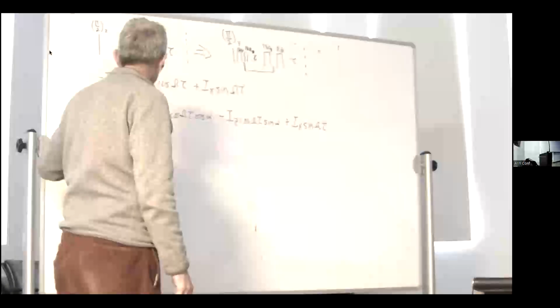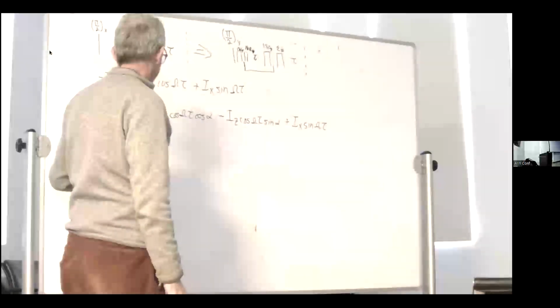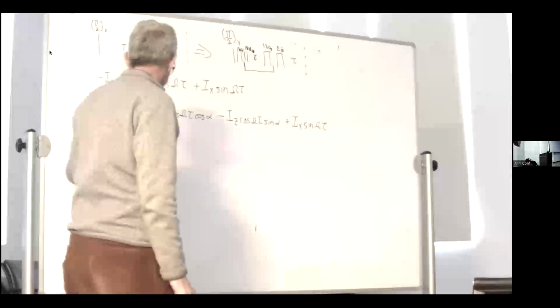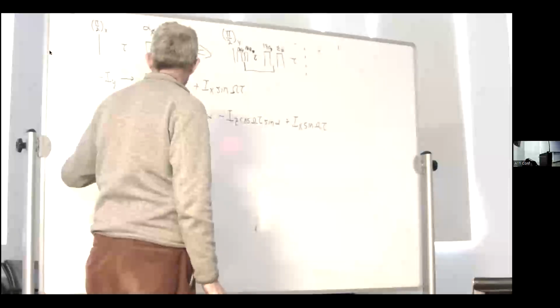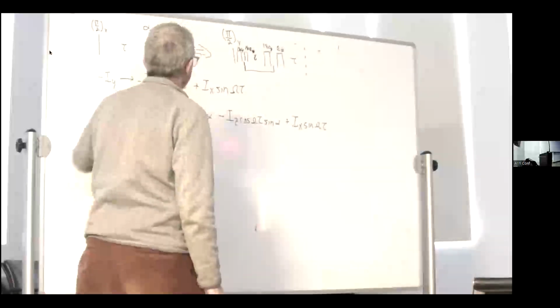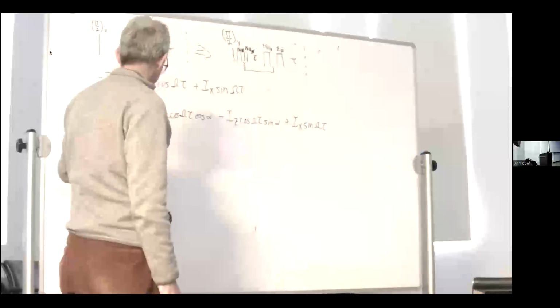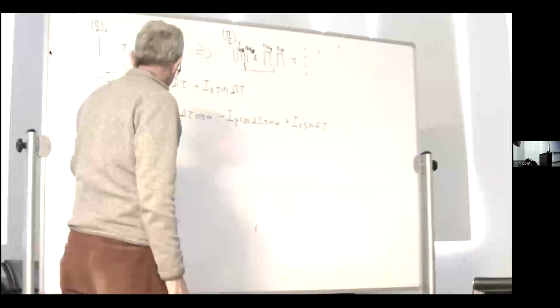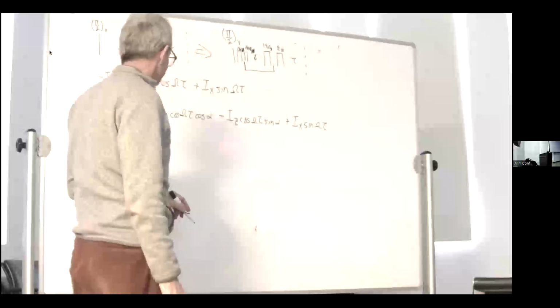A 180 minus phi, tau, 180 phi. Sorry, minus phi should be a phi.